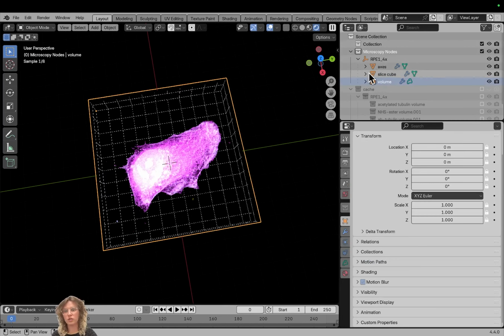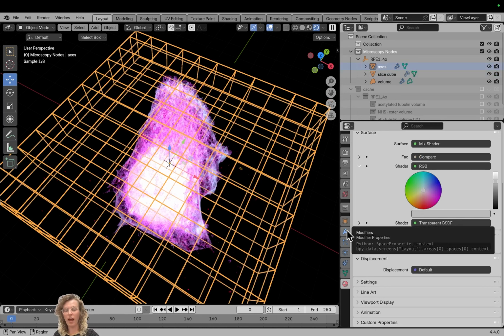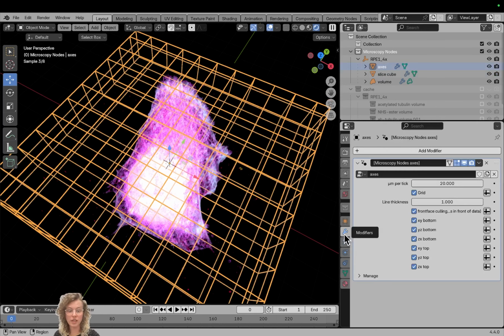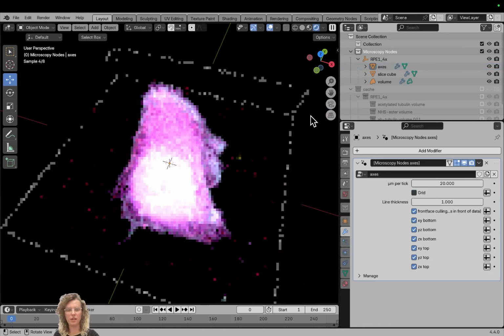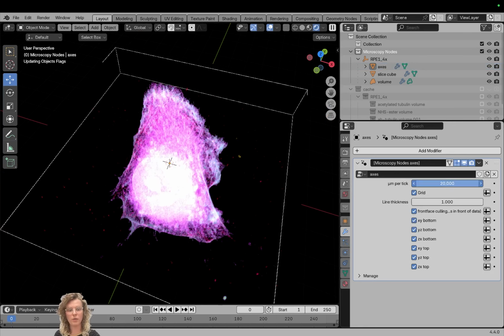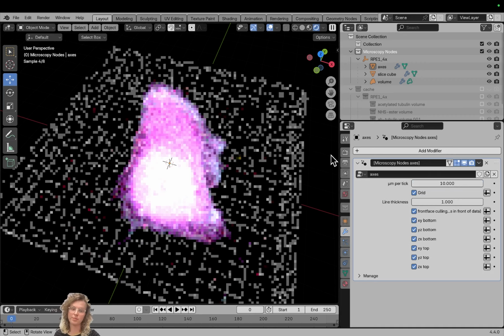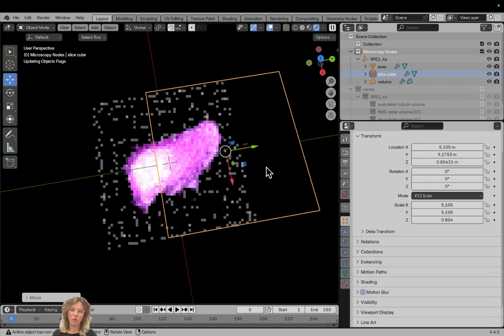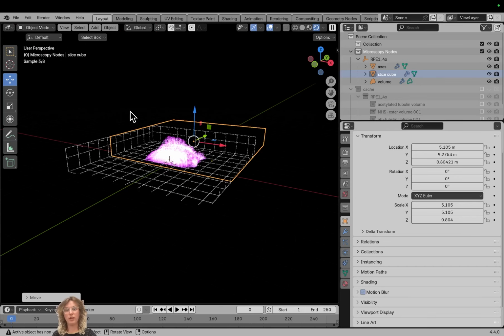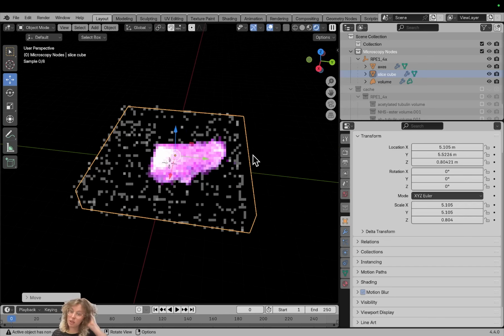We have here all the components of our thing. So here we have our axes, and if we want to select how to change our axes, we can go here to the wrench icon, to the modifiers, then we can, for example, say, oh, I don't want this to have a grid, and then it will just be a flat box, or I want it to have a grid, but I want it to have a different amount of microns per grid line. So then it will become way denser. The slice cube slices our object, so we can move this in multiple ways and then slice our object, and then we can also rotate and animate this movement or scale the slice cube. So this is very flexible.